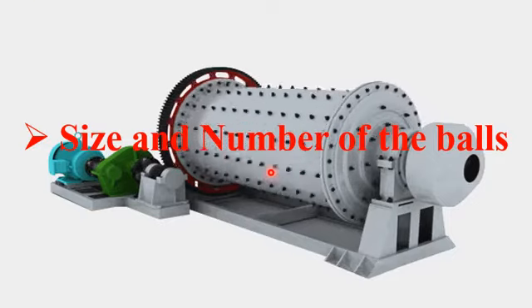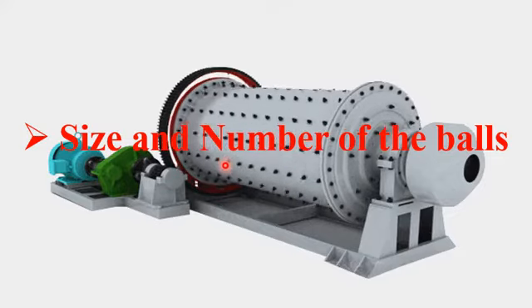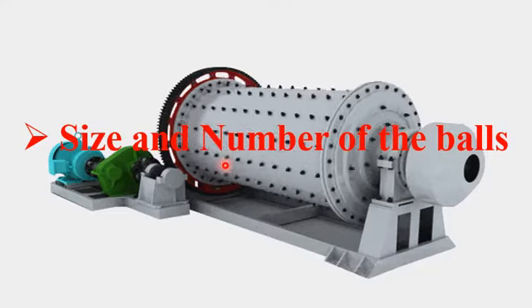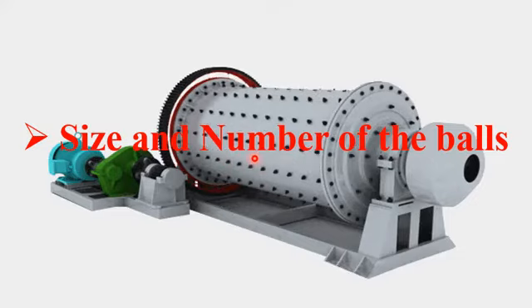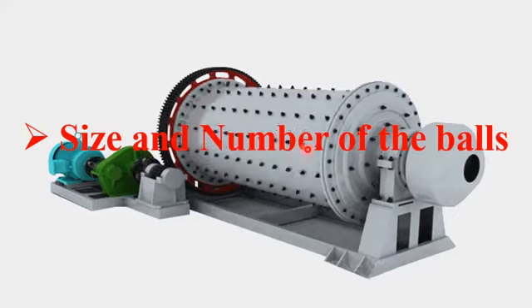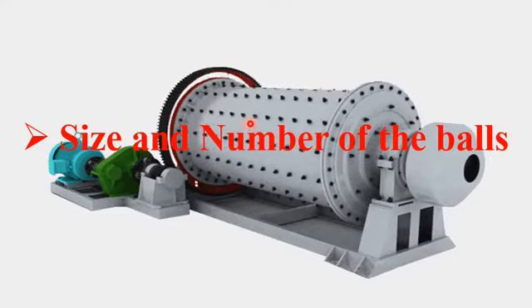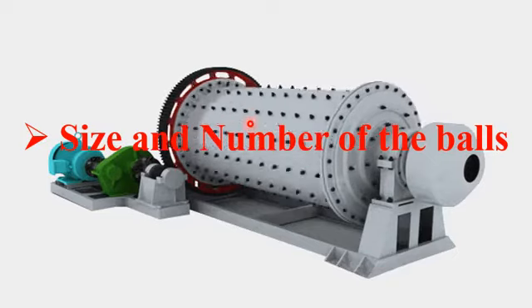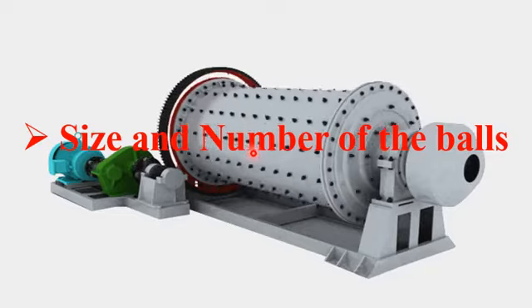So dear student, please note that if the balls are loaded too much in a ball milling apparatus, they may overlap with each other during the process. Let's say this ball drum has too many balls inside it, then there is a possibility that during the crushing of the bulk material these balls overlap with each other.